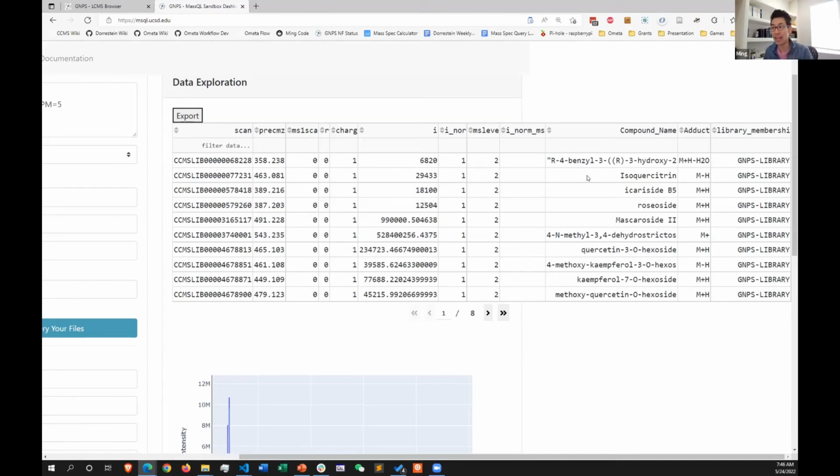And the real data confirms that what we're looking for is indeed what we find. That gives us some confidence that if we applied this to our own unknown data, it would throw out everything else that wasn't a glycan and enrich only for molecules that have a glycan on it. So then you can start to prioritize what you're looking for.